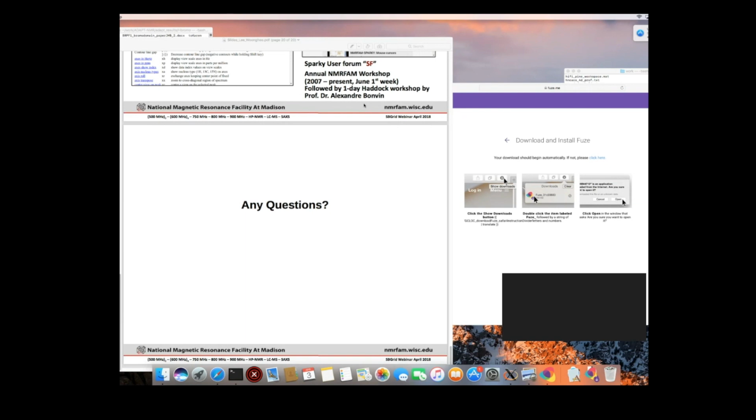It's not a big deal. You just check the pre-assignment and click the button. Then you get more assignment and more assignment and more assignment. So really, the clever use of the tool will make your life much easier.